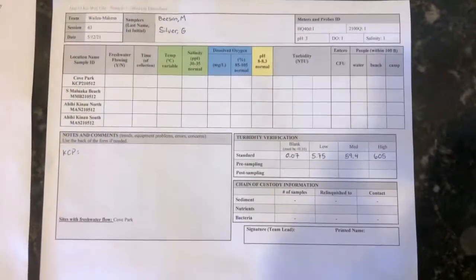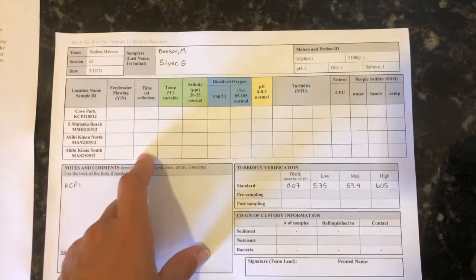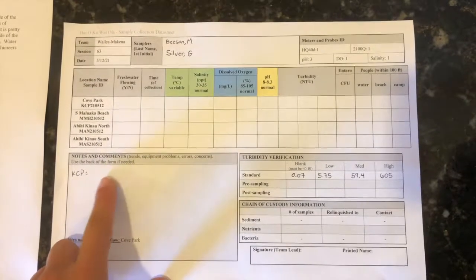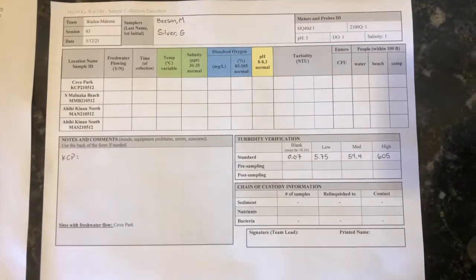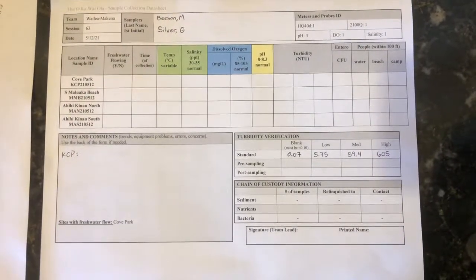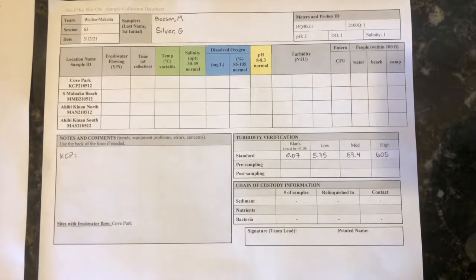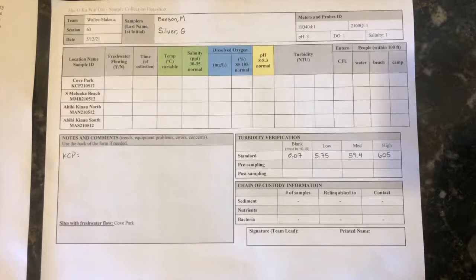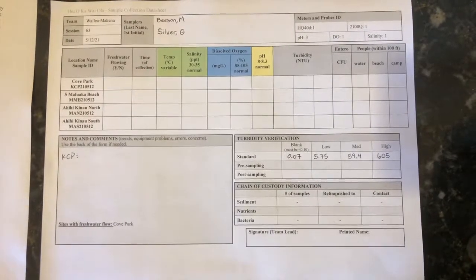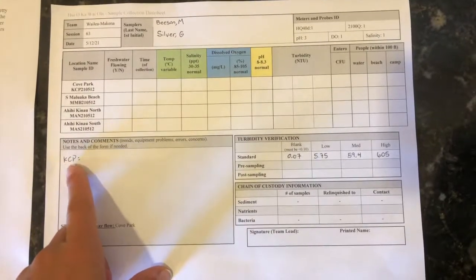Make sure to record the start time that the samples are taken. Take note of any other unique or interesting events occurring during sampling. Some observations include wave height, color clarity of the water, beach activity, previous or current weather patterns, etc. It is especially helpful to know if there has been rainfall at the site in the last 24 to 48 hours. These notes will go in the bottom left box on the datasheet. Write the site code, then a hyphen or colon, and record notes.